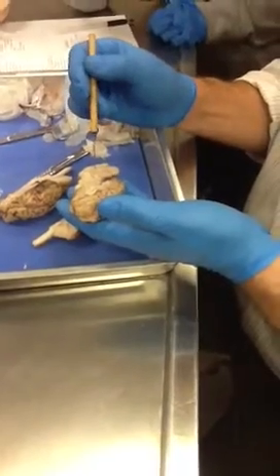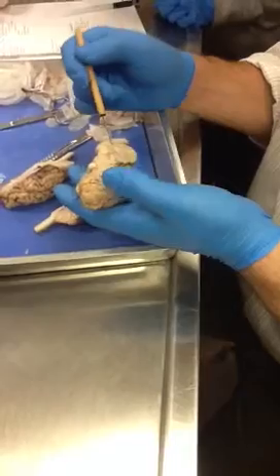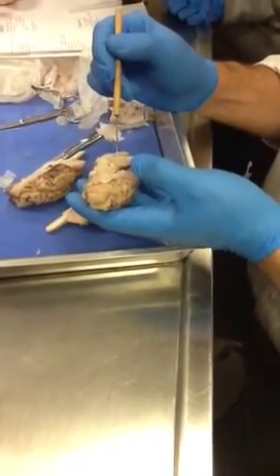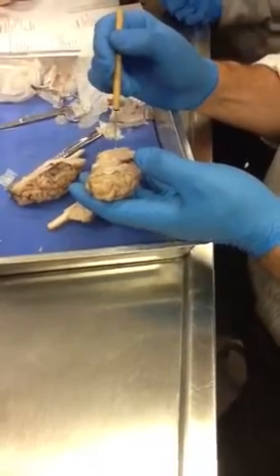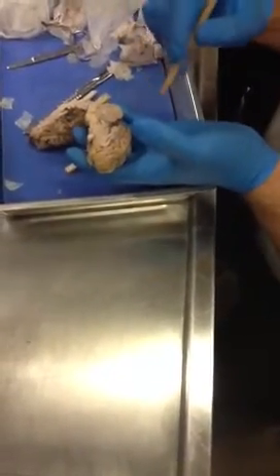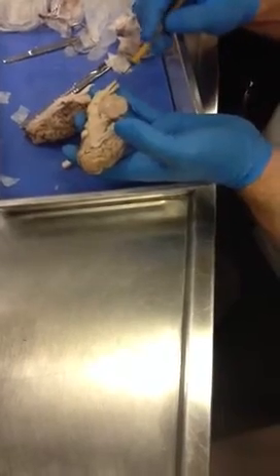Down here, and then you look, you see this little opening in the cerebellum. That's where the fourth ventricle is. Sometimes you'll see a little capillary in there at choroid plexus. So the fourth ventricle is right here in this space between the pons and the cerebellum, right back here. And then it's going to flow down from there. Remember, it goes out into the subarachnoid space, but it also flows through this central canal, all the way down the center of the spinal cord, right here.